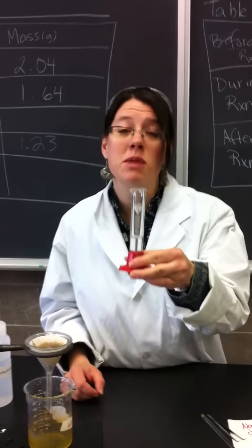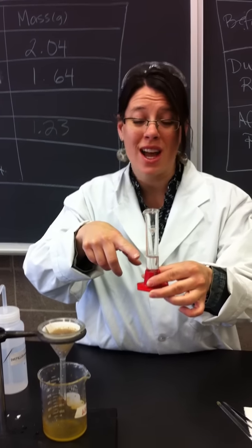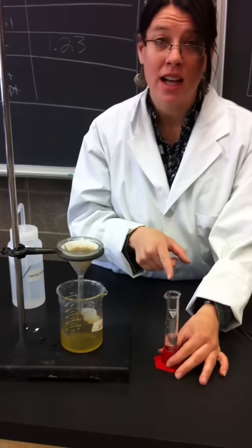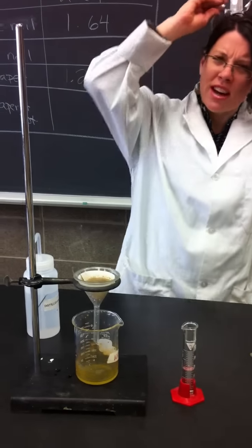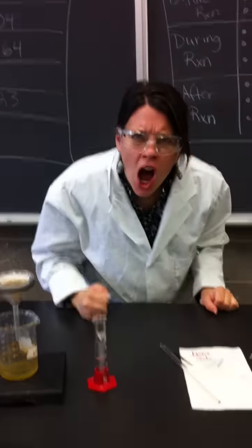Okay? Another thing we're going to do is wash it with 15 mils of hydrochloric acid. This is 1 molar hydrochloric acid, so it's pretty serious. So you want to be careful with this acid, please. I will definitely put my goggles on. Of course, they should have been on the whole time.